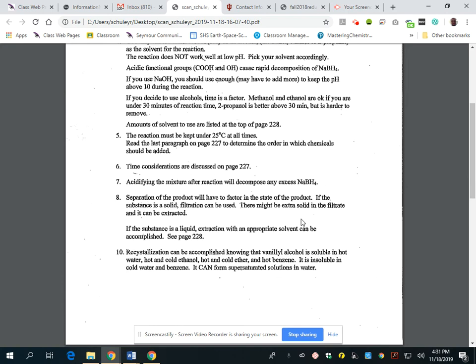We're going to analyze the product by IR. We do have a device that can analyze solids on the IR, and we're also going to get the melting point. You'll probably want to let the material dry over the week and then get the melting point the following week. So that would give you 2 reports due the last night of class. Or if you want to just suck it dry a little extra because it's a fairly short reaction, you can probably get it dry enough that you could get a melting point that evening. That's up to you on that part.